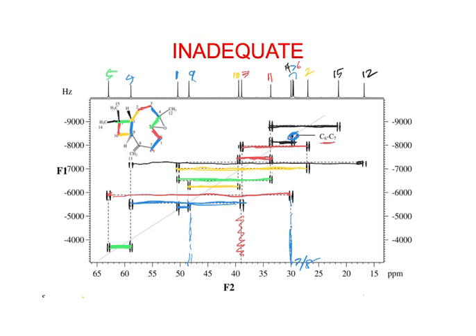So it is a pretty amazing experiment. Yeah, but you will never do it. Well, if you have a lot of sample. Yeah, or you have an enriched sample. Yes, or less. They can use some of these kinds of things too, like if they're doing biosynthesis, right? Sometimes they can feed a microorganism C13 labeled acetate, and that gets incorporated into the molecule.